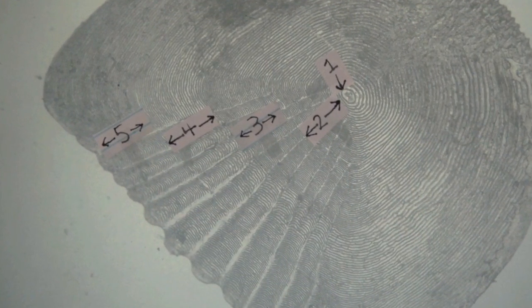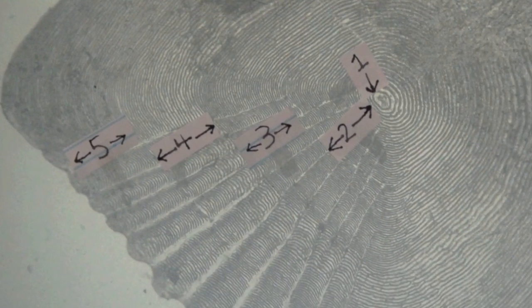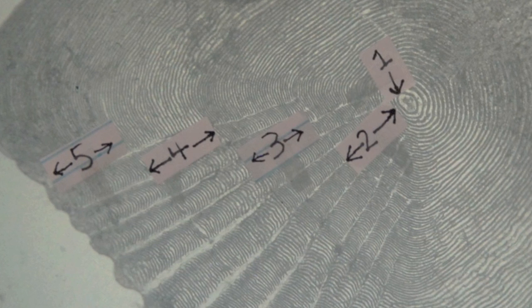To determine the age of the fish, count the center of the scale as the first year and then count the sections between these transitions.